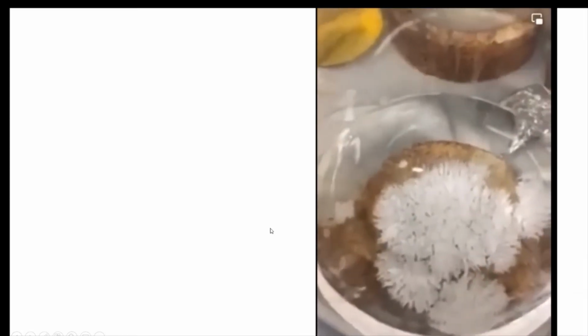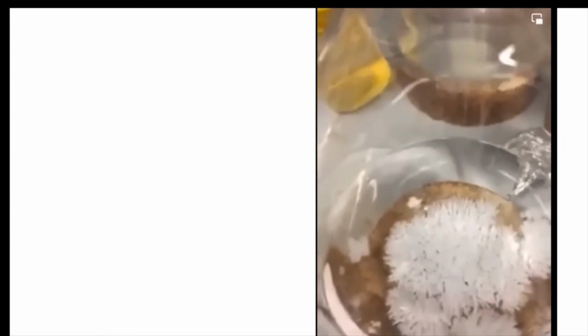In organic chemistry research, recrystallization is a miracle purification technique because it will save you time and effort not to do a column. Many of us may know the techniques and solvent choices, still I'm going to say a little bit about it.